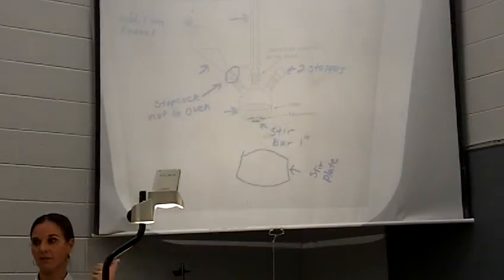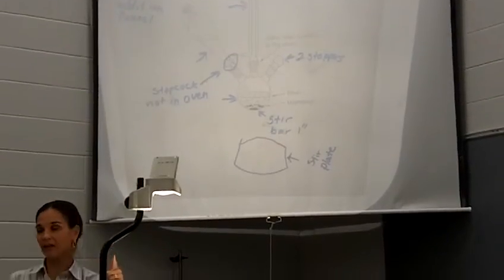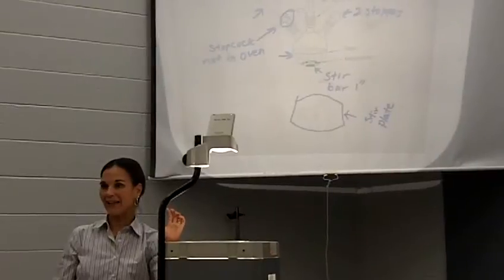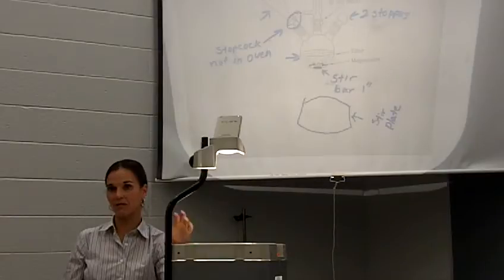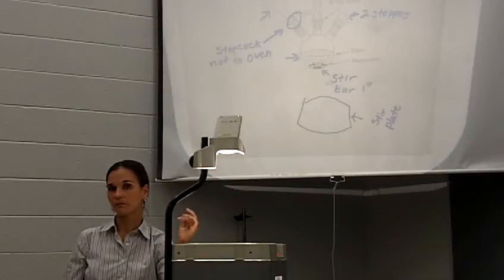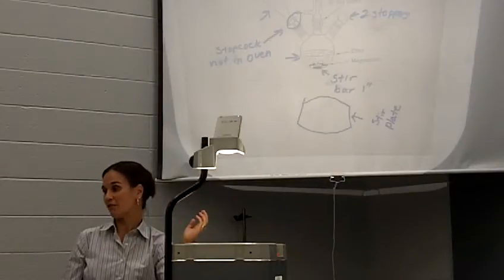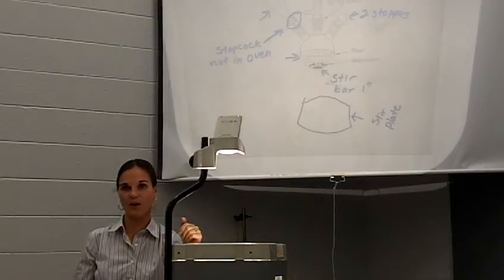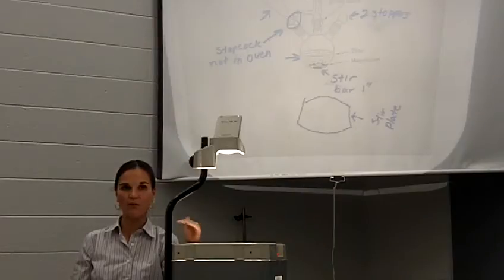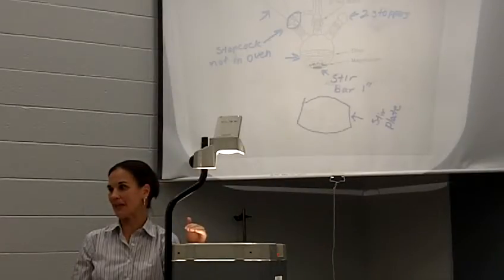Big important things though. The reaction of your magnesium and your alkyl bromide. If you add neat alkyl bromide to your magnesium in ether, very exothermic reaction will happen very quickly. Your ether will get very hot and start boiling away. And what is a problem with ether because it's so volatile? Things that are volatile can also catch on fire, right? So we don't want any fire, okay? So no neat alkyl bromide going in on your magnesium all at once.